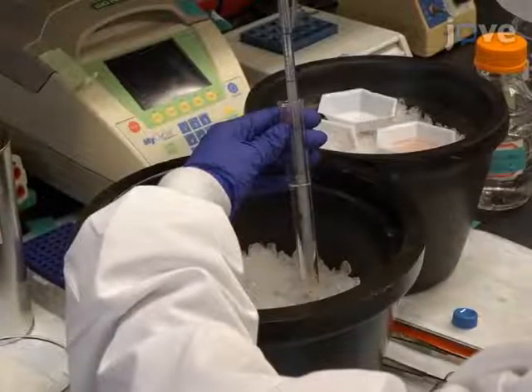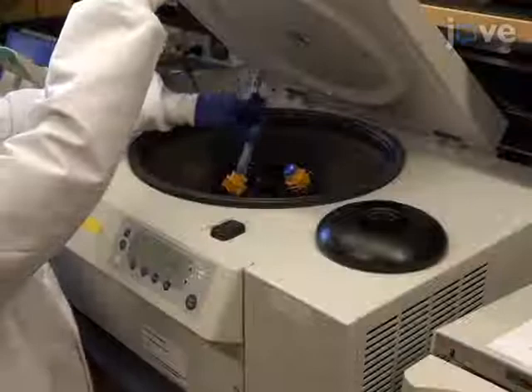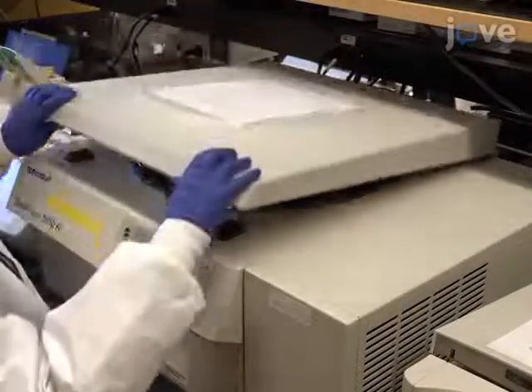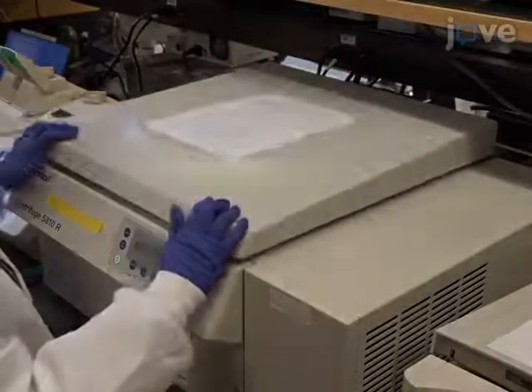Transfer the homogenate to a 15 mL tube, and then centrifuge at 600 times G at 4 degrees Celsius for 5 minutes to pellet unwanted nuclei and unbroken cells. Transfer the supernatant to a fresh 15 mL tube and centrifuge at 10,000 times G at 4 degrees Celsius.